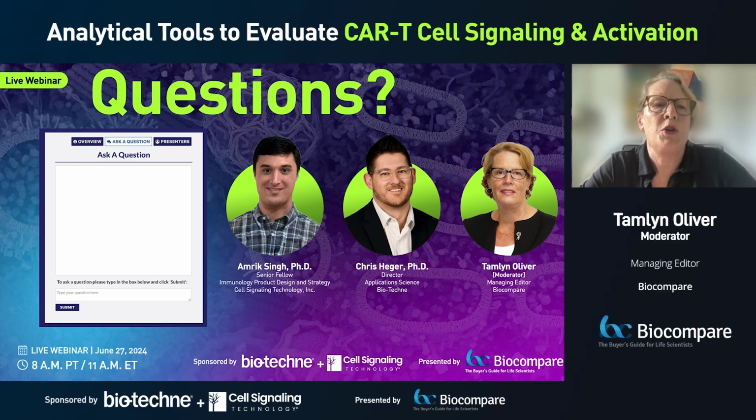Next question. For CARs which do not have scFv, how can they be detected? Can protein L help in this case, or are there different methods? And what are the advantages of having scFv in a CAR construct?